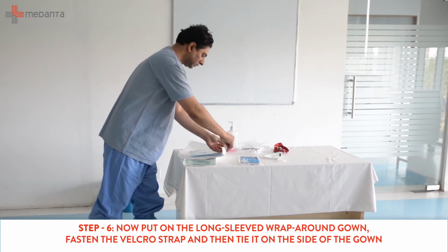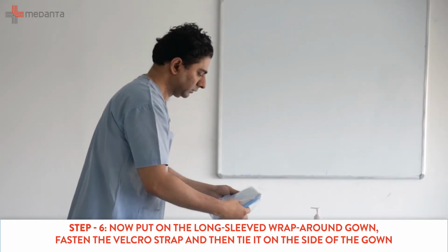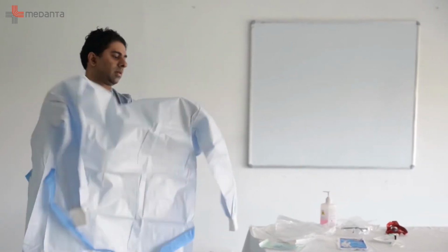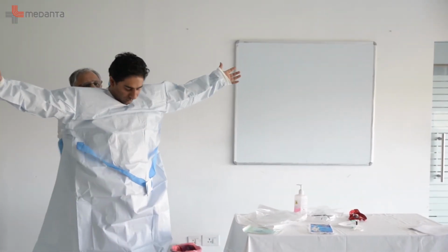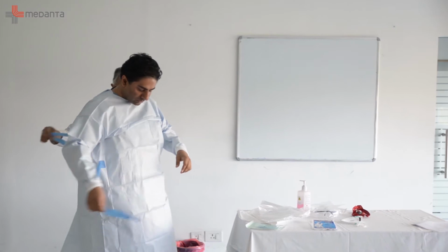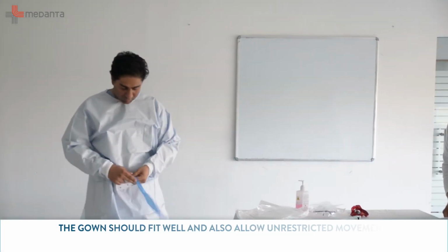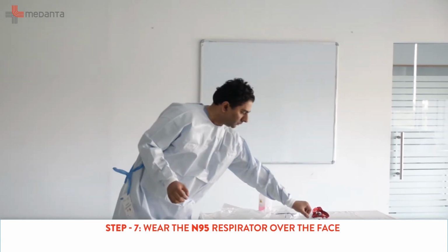Now put on the long-sleeved wrap-around gown and tie the loops. The gown should fit well and also allow unrestricted movements. Step 7. Wear the N95 respirator over the face.